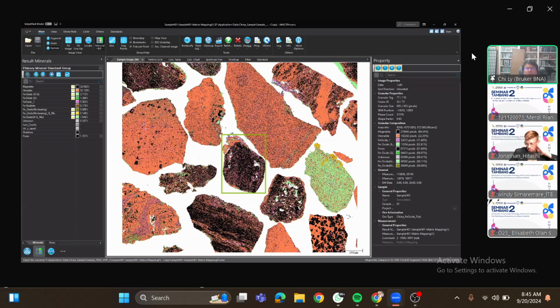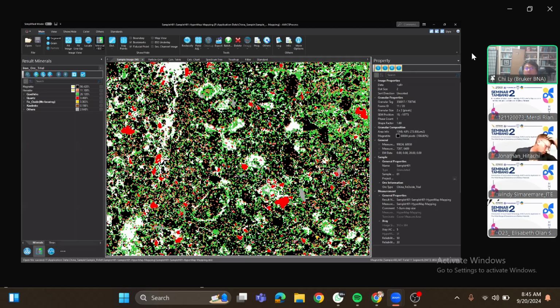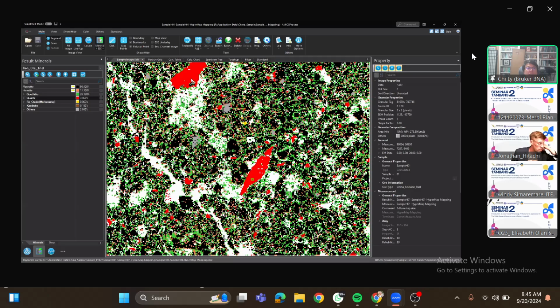So they've taken the incoming material, they've crushed it, ground it, pelletized it in preparation for blast furnace introduction, but they can also now understand how good was the pelletization in terms of removing some of the deleterious elements. In this case, probably not so good, because for some reason they've also incorporated chunks of quartz all throughout the pellet, which is obviously going to be an issue for them. But at least now they know, and they can adjust their process and understand where the actual quartz came from to actually improve the product that they're introducing into their blast furnace.